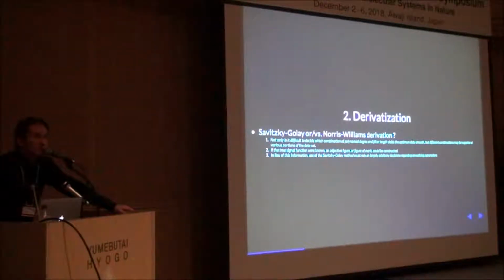Absorption values are continuous, and you can have any number possible in the measurement range of the instrument, but for the wavelengths you will always have discrete values. Norris-Williams derivatives pay attention to that, and they change the step and the gap between the wavelengths that are used in derivatization. That's the main thing.